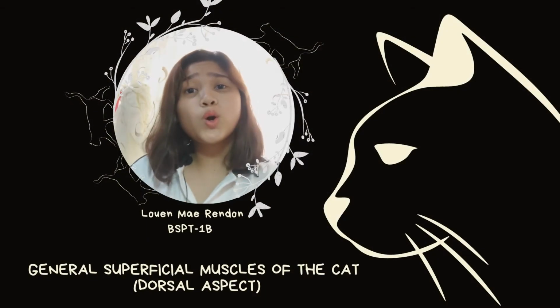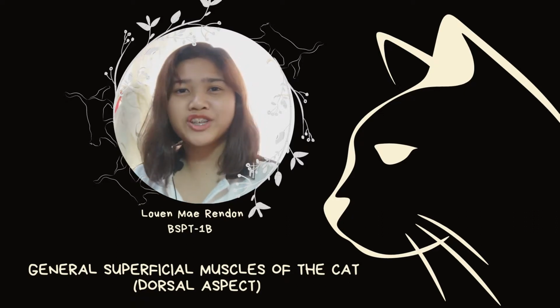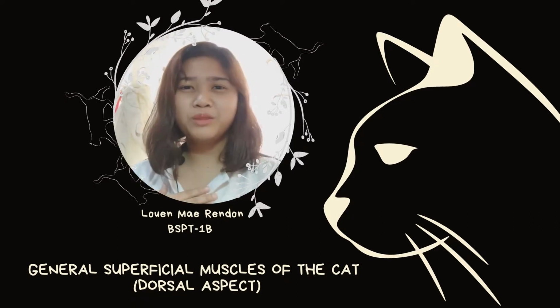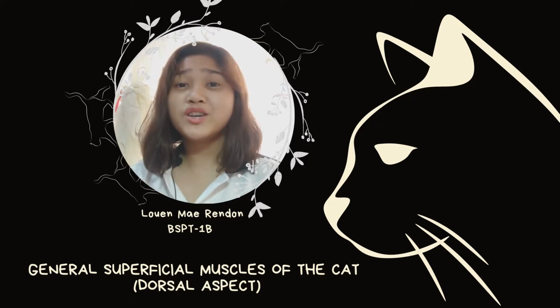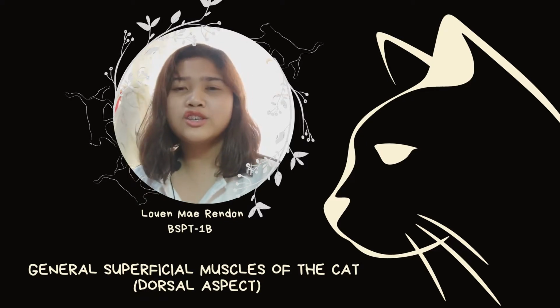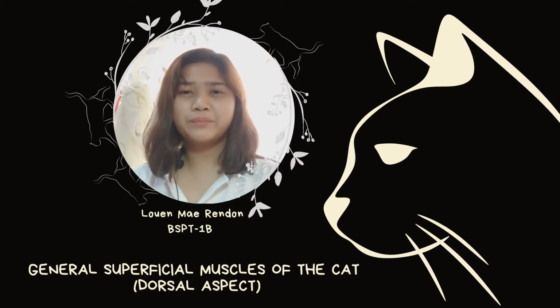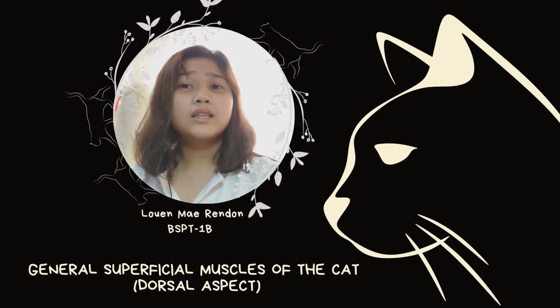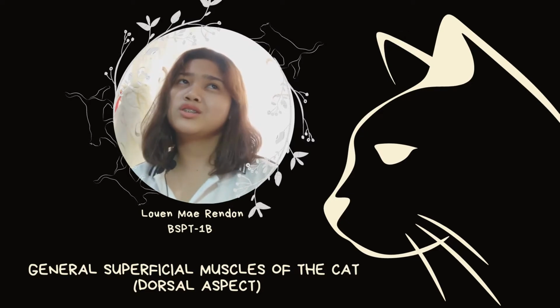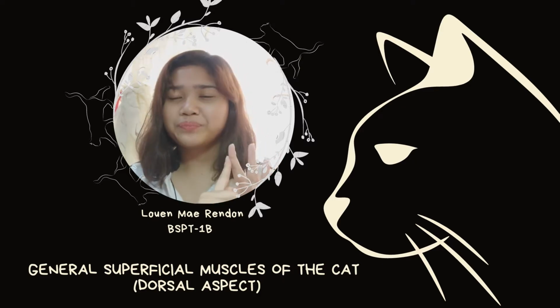Do you want to know or learn about the different parts of the muscles of the cat, specifically in the dorsal aspects? Hi, hello, I am Louen. In today's video, as you can see in our title below, I am going to discuss, locate, and identify the generalized superficial muscles of the cat, specifically in the dorsal aspects. And I'm going to add the OIA, but I'm just going to discuss the three parts: the origin, the insertion, and the action. So without further ado, let's get into the video.